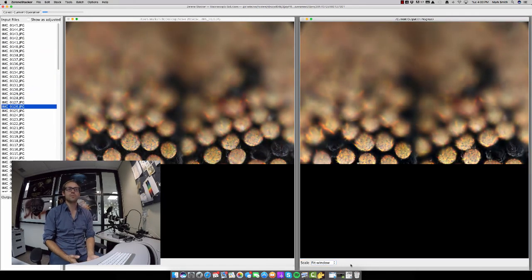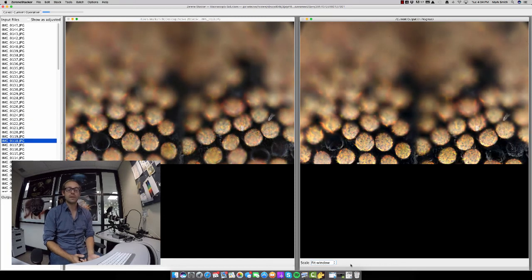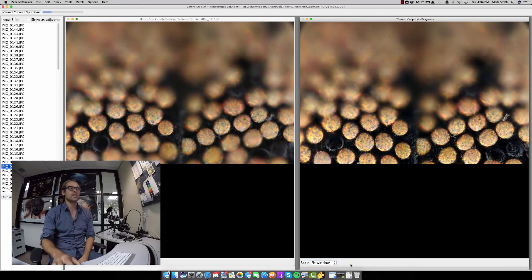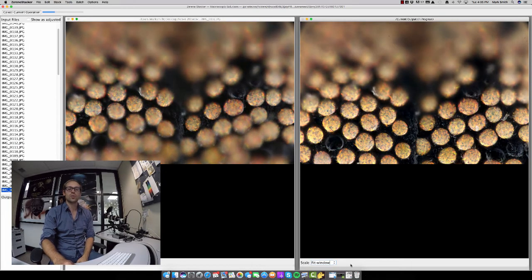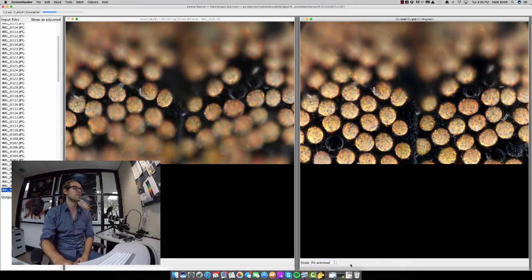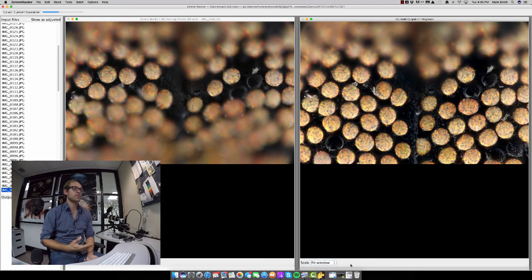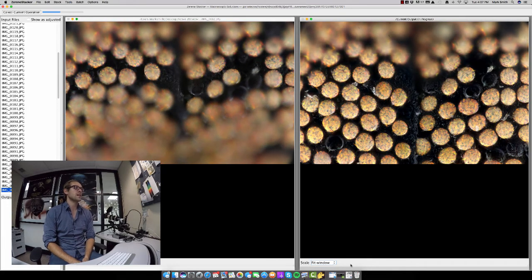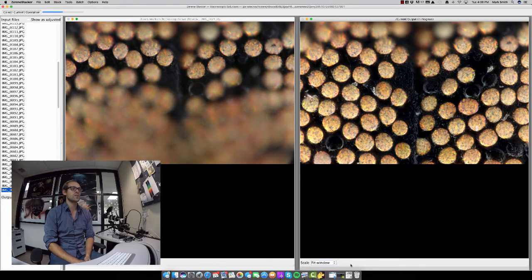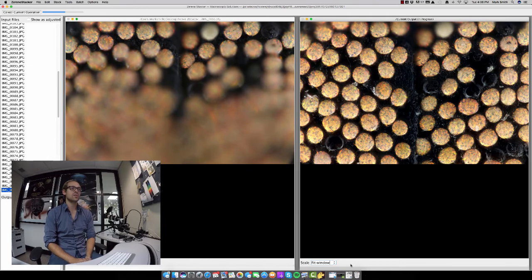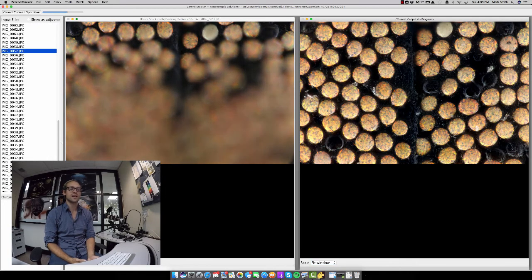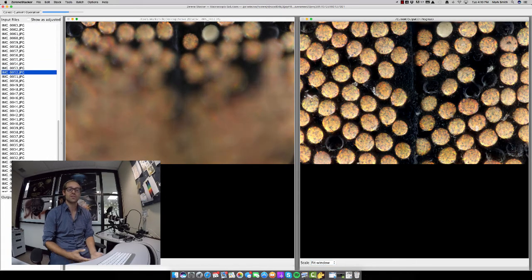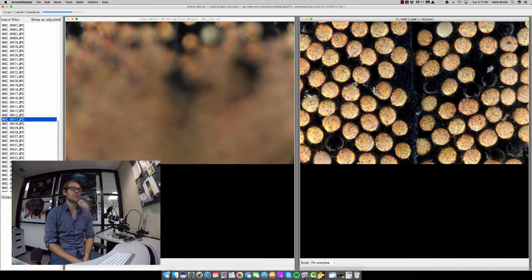I'm sure now that you've realized we're at 50X magnification, you've seen that the scales actually have a really unique property. Being a geologist, I always noted that the scales on these weevils sort of look a lot like the mineral opal wood, which is hydrated silica. And it's pretty neat. I looked into it a little bit to see if there's any research papers out there to see if people have looked into the composition of these scales. Some people have looked into it, but I didn't see any conclusive microprobe analysis or if they actually tested if it was hydrated silica, to see if this beetle is maybe sequestering silica.